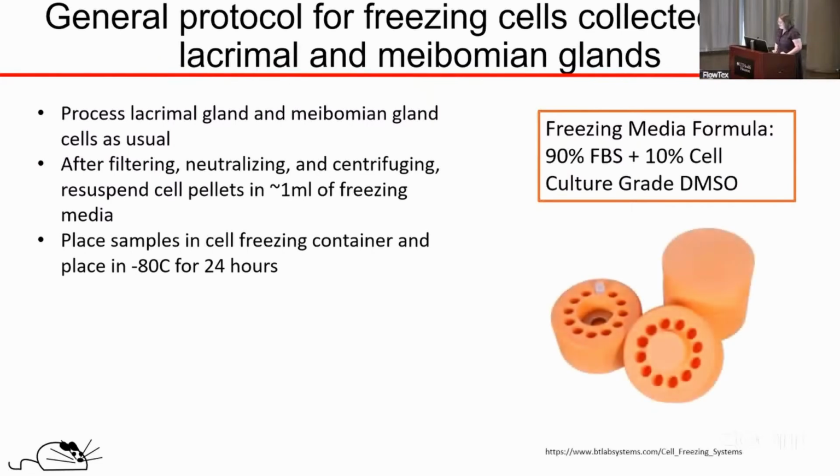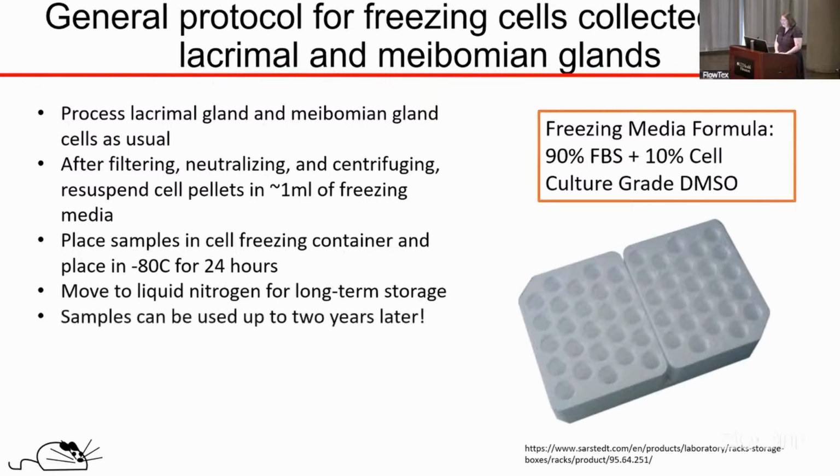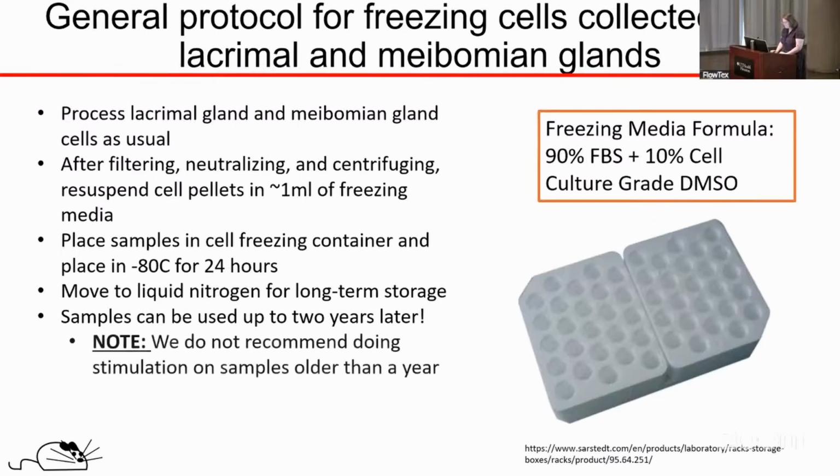We really like these foam ones. We call them Mr. Freezies. They're really great, but in a pinch, and if you don't have the money for that, you can just use 2 styrofoam containers on top of each other, and they work approximately as well. So then afterwards, we move them to liquid nitrogen for long-term storage, and I do mean long-term. We can use the samples up to 2 years later, and I'm going to show you some of that.